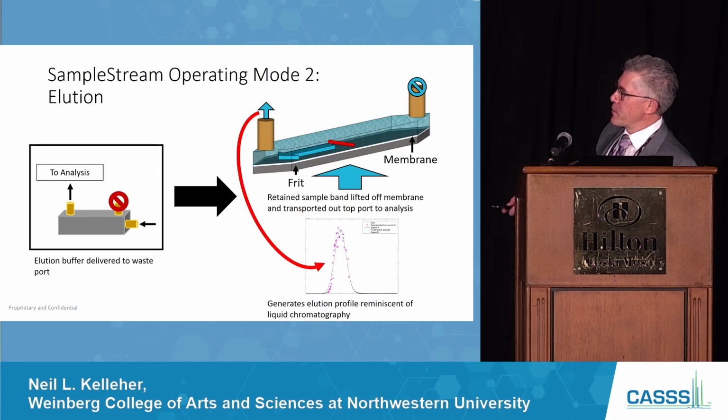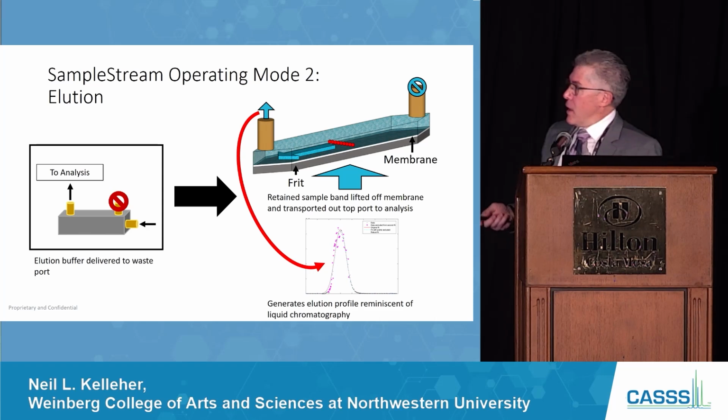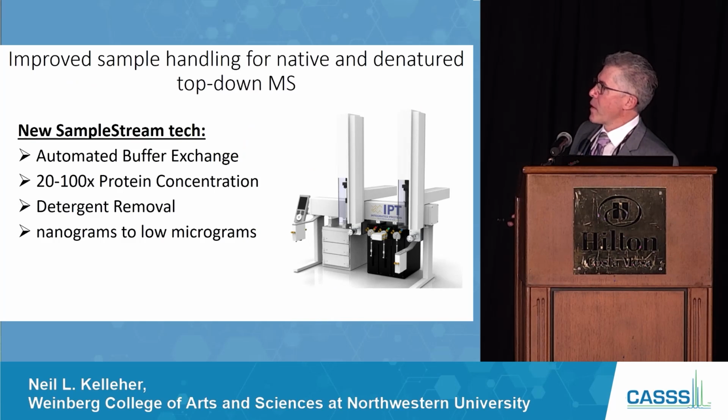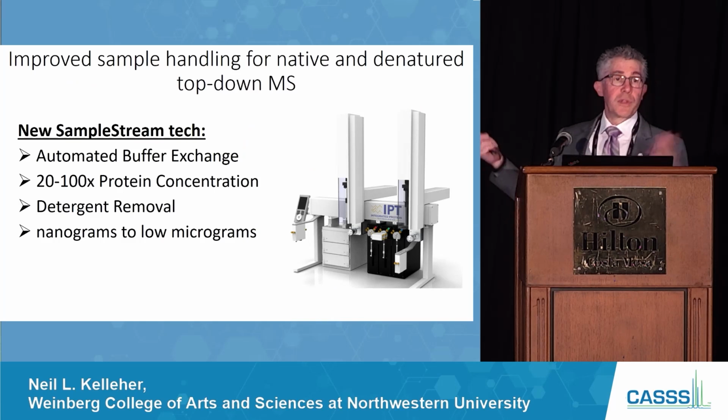And out comes a chromatographic or electrophoretic-like looking peak. And it's a laminar flow on the way to the mass spec, so you get what you might imagine. And there's all sorts of other things. It's all on the Integrated Protein Technologies website. That's all what I just said. Phil's been doing this for 8 years.